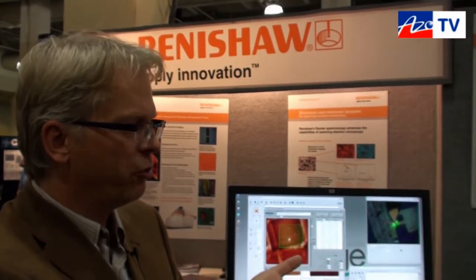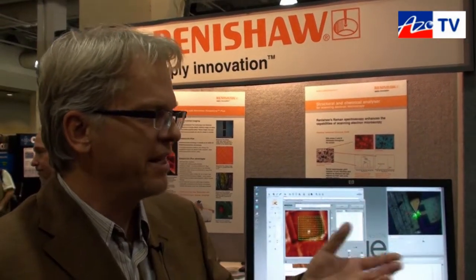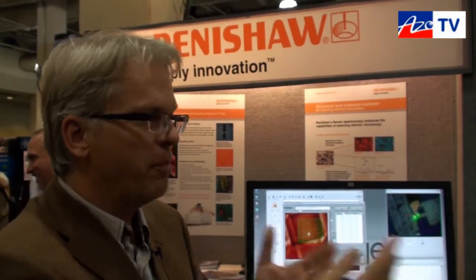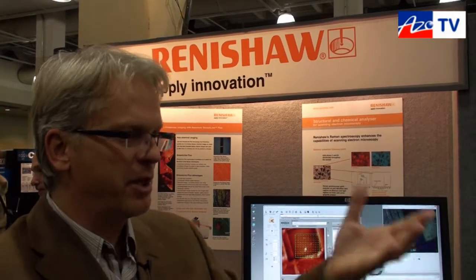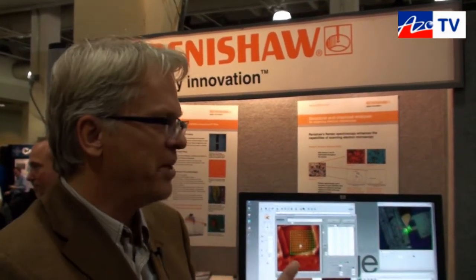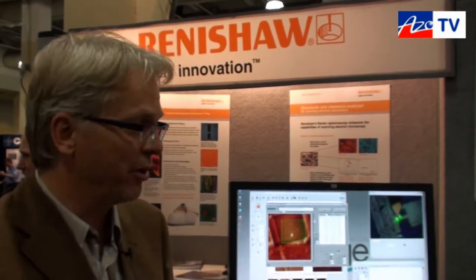One thing you have to take care of when you combine these systems is you always make a compromise. You're putting two systems together — the AFM might partly disturb the optical access a little bit, and on the Raman side you have to be careful that you don't introduce vibrations to the AFM side. So you want to be sure to start with a very stable system, and a lot of systems on the market are not stable to start with. That's why we selected Innova — it is a system that is very resilient to external vibration and very stable for that specific application.